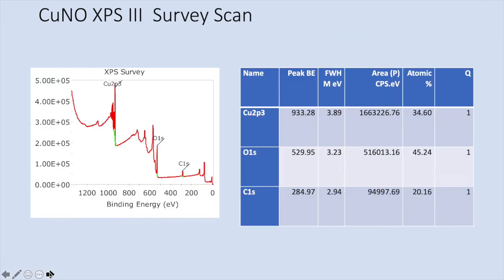This should be NP — sorry for the typo. So this is the survey scan we had. A survey scan doesn't really distinguish the different types of oxide, but we have copper at 34.6%, oxygen at 45%, and carbon at about 20.1%. That sounds pretty good.